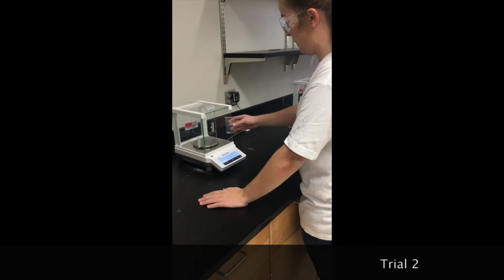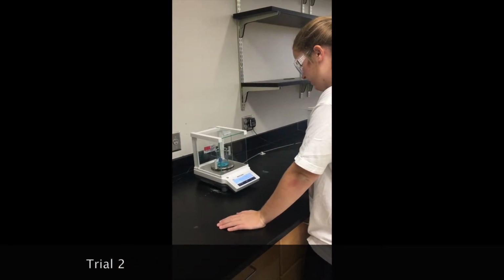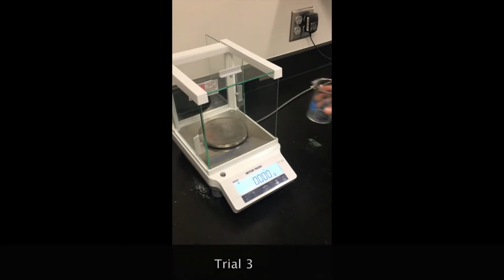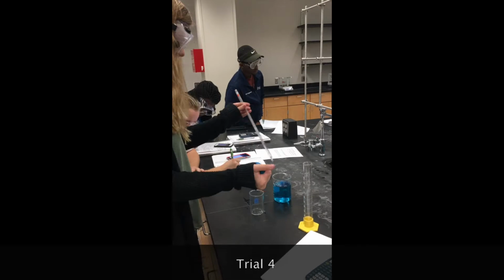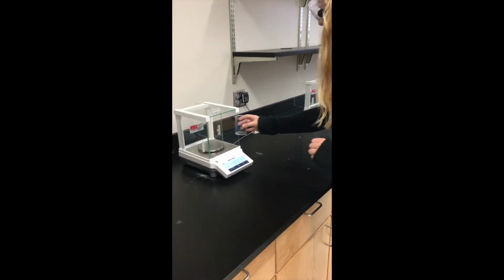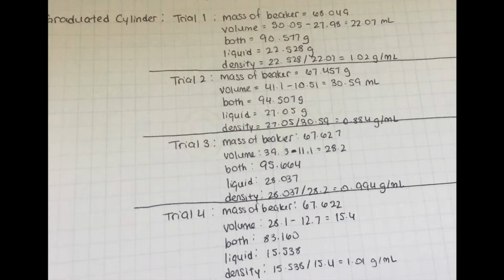Repeat these steps for trials 2, 3, and 4. These are the values we got for trials 1, 2, 3, and 4.